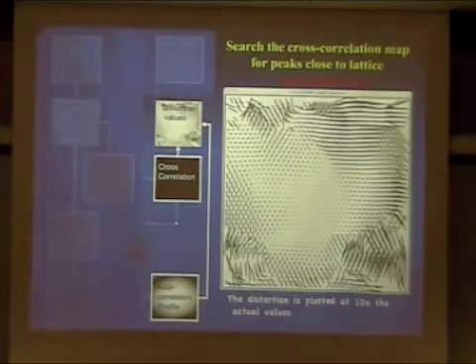Okay. So the other half of the information is how far it is away from where you expected it to be, as Deirdre was asking. And when it's a search, it doesn't just search continuously. It searches at this point around it, finds the peak, then shifts to the next unit cell according to the lattice parameter. Search around there, not everywhere else.